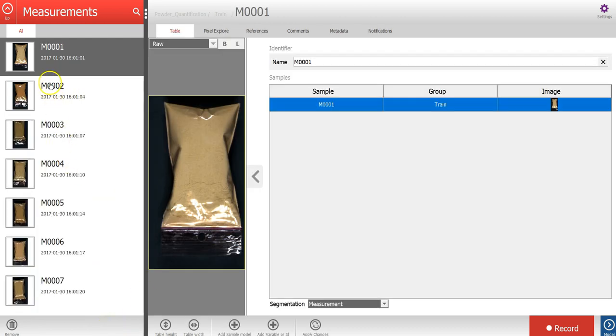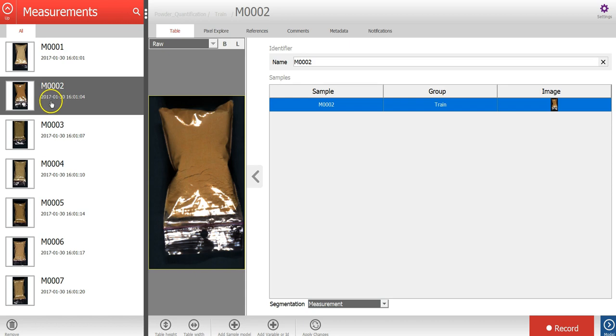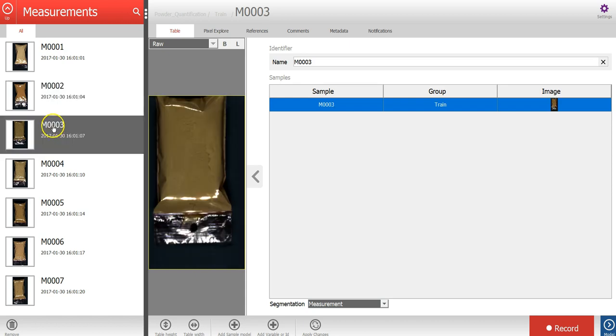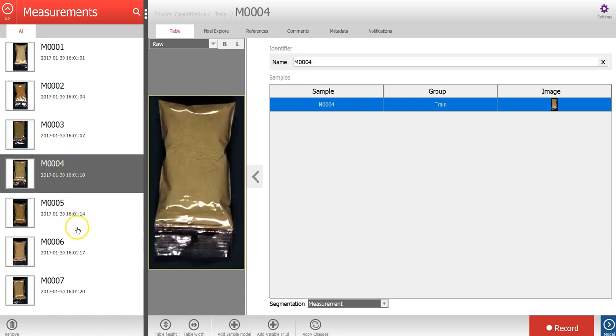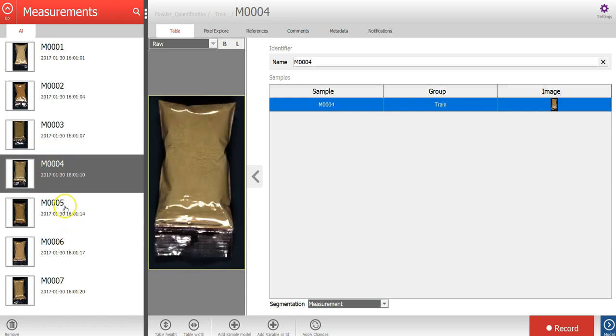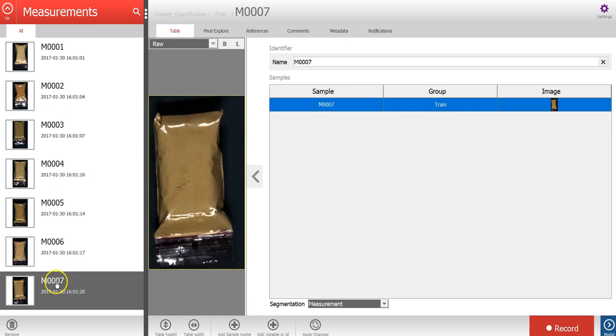In the menu on the left side you can see all the individual images, or measurements as we call them in Breeze, that are in this group.